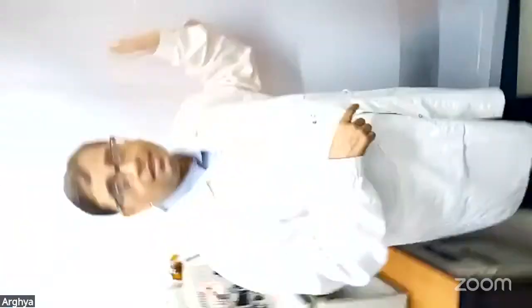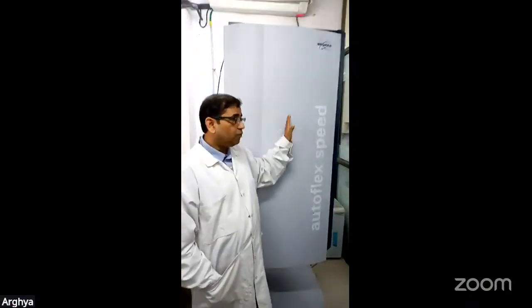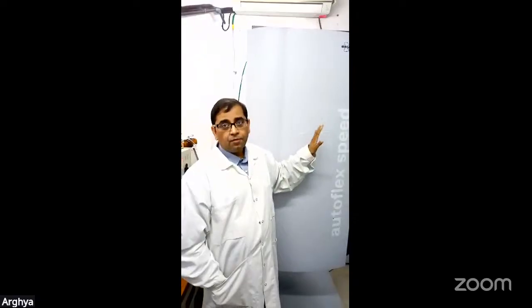Yeah, so now what you see here is the MALDI-TOF Autoflex instrument, which is one of the types of mass spec principle. When we talk mass spec, we talk about ionization source, so MALDI or ESI. Both of them are top-generation technology. Both of them got Nobel Prize. This was the very first and robust approach of doing mass spec. So you can do MALDI-TOF or you can do ESI.